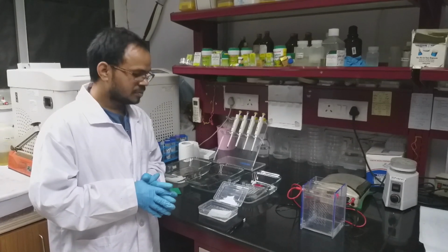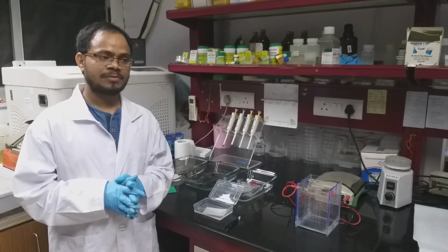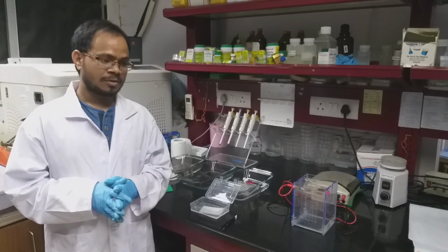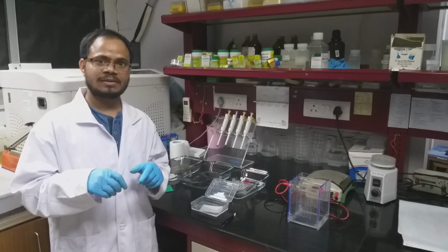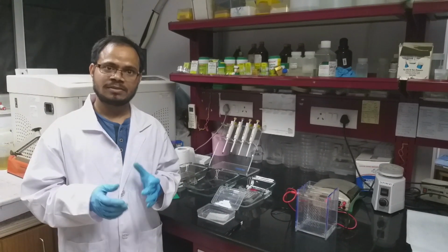The processing for Western blot is different for nitrocellulose and PVDF. If you are using PVDF membrane, you have to cut the part, unless you have ready-made pre-cut blots, then there is no need.